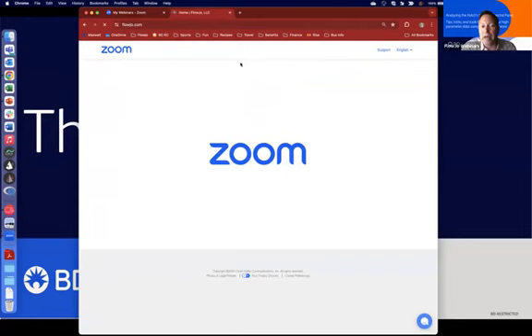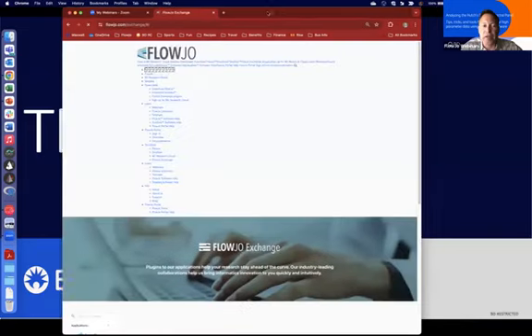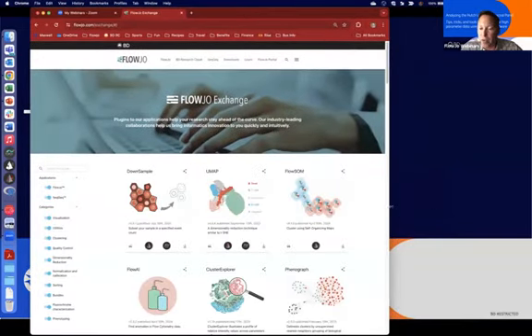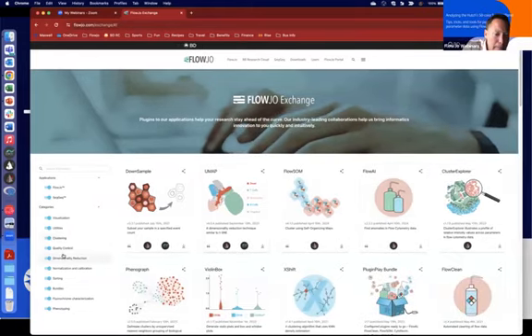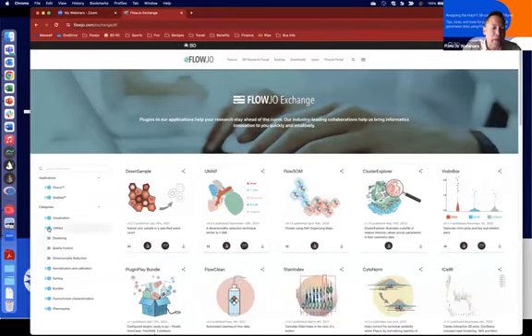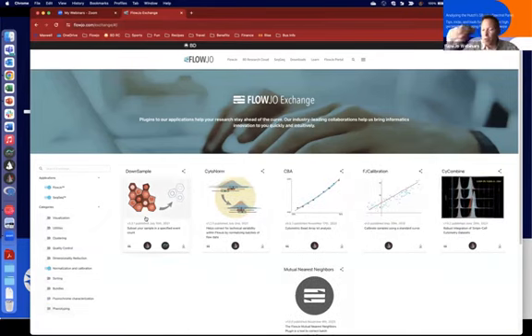If you've thought about it in advance and you've put in a directly comparable control, you say these are healthy cells and we expect them all to be the same across all the time points, then something like CytoNorm can be used, which is another one from Sofie Van Gassen's lab. There we go, let's go to normalization. It will use that control as a reference point to figure out what all the corrections needed are. If you don't have that standard built in across all the experimental points, then that one won't work.